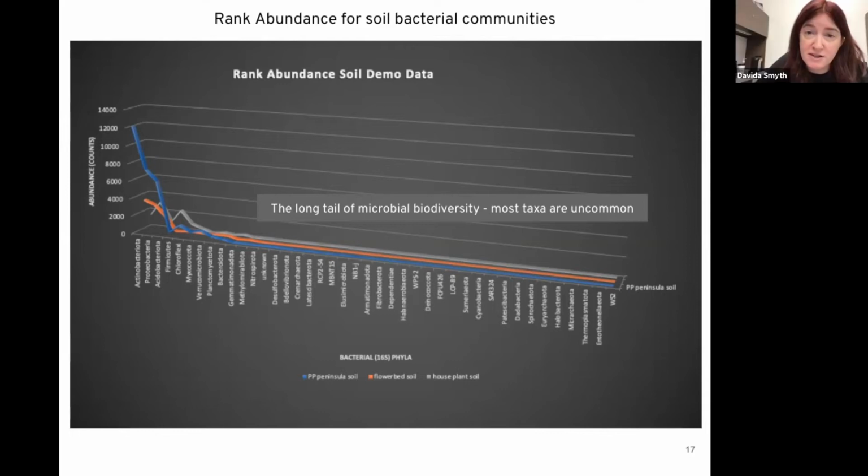That's what I was going to say as well. And partially the reason why we don't do more than one sample when we're doing this is just cost. But ideally, you should be taking more than one sample and showing the reproducibility of what you're finding. And actually, there are replicates for these samples. When I was doing this rank abundance, I only did these three so it wouldn't take me half an hour to make the video.